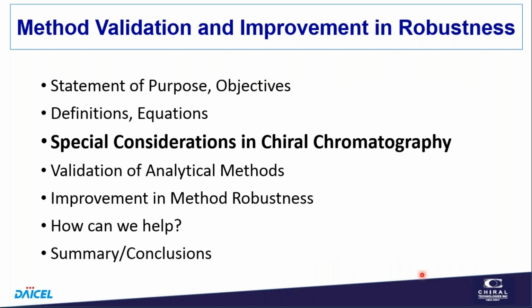That's a lot of information very quickly. These are equations that you probably are familiar with from dealing with reverse phase chromatography. If you're not real familiar with them, I think that probably would help you in your achiral chromatography. Just do a little reading in a fundamental text on liquid chromatography. The discussion is much more in depth than what I just went through.